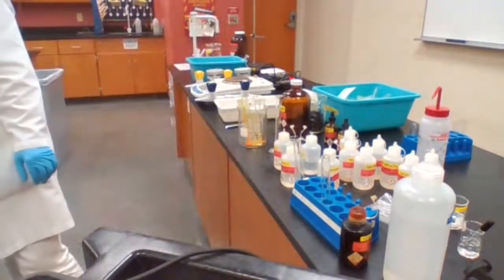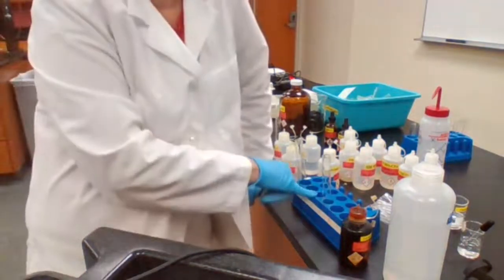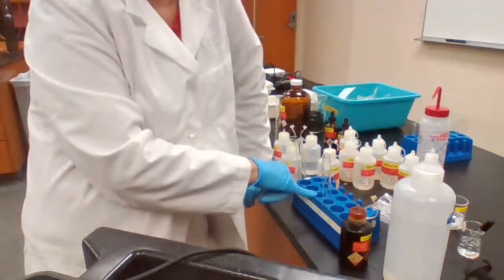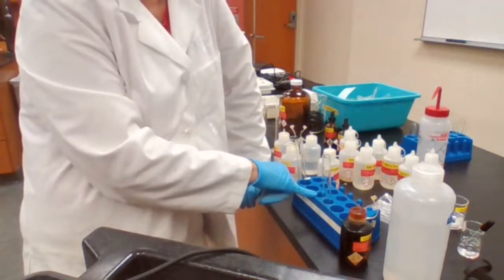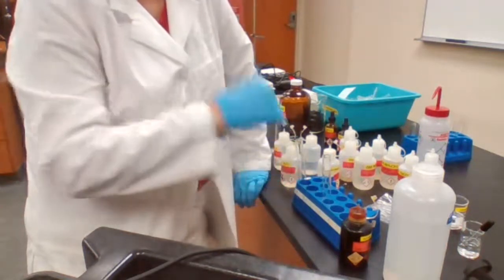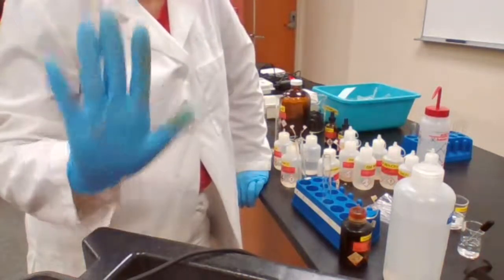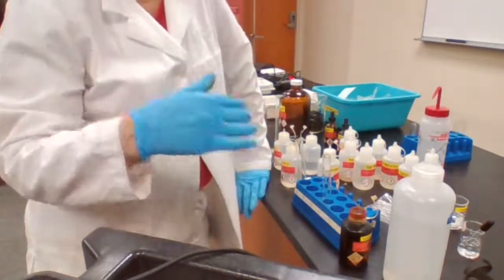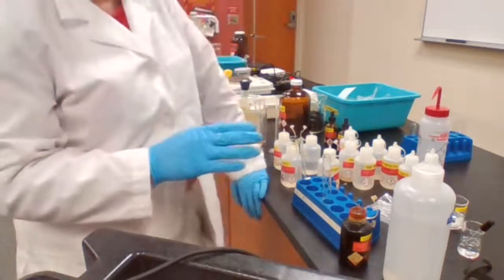Wasn't that C that was positive? Was it B or C? Which one was negative with the first one? Please don't get mixed up. Okay. The first one, B was negative when I added the DNP, right? Okay, B was negative. So B was negative for the first test for DNP, the 2,4-dinitro-DNP.